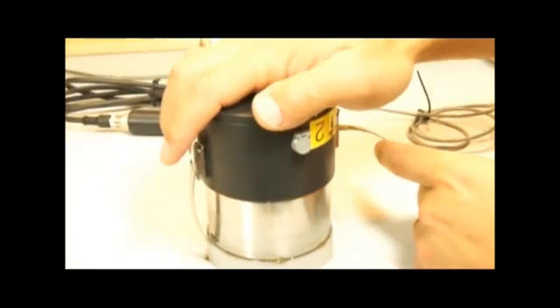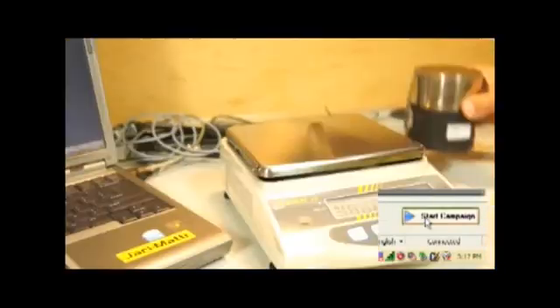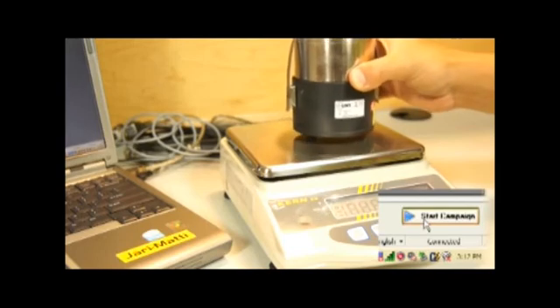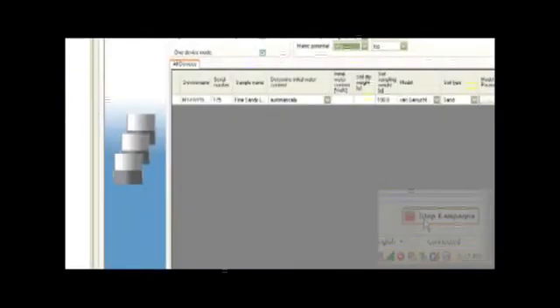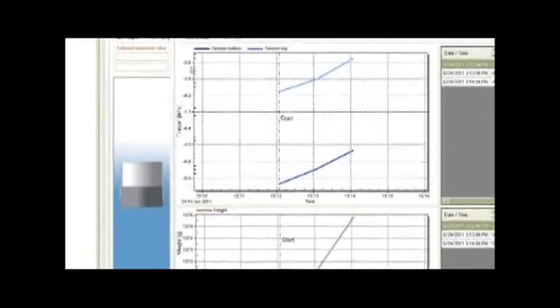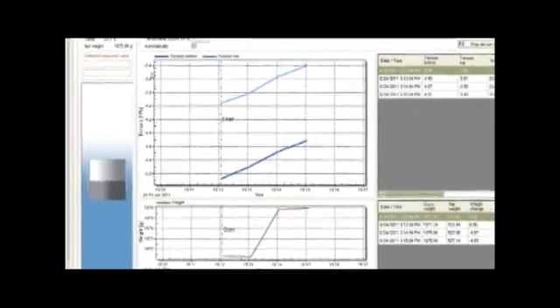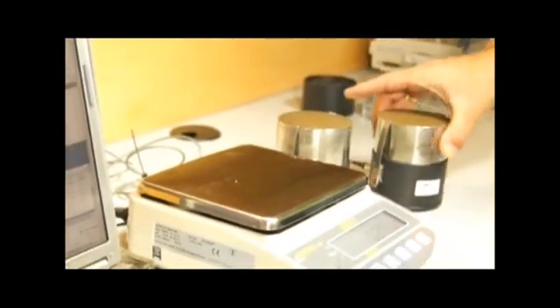You're ready to start the moisture release curve. Set the soil sample assembly on the tared balance. Now click on Start Campaign in TensioView. Let the HYPROP do the rest. A single moisture release curve takes between 2 days and 1 week to complete. Up to 20 samples can be run at one time using available extension kits. That's all you need to know to get started.